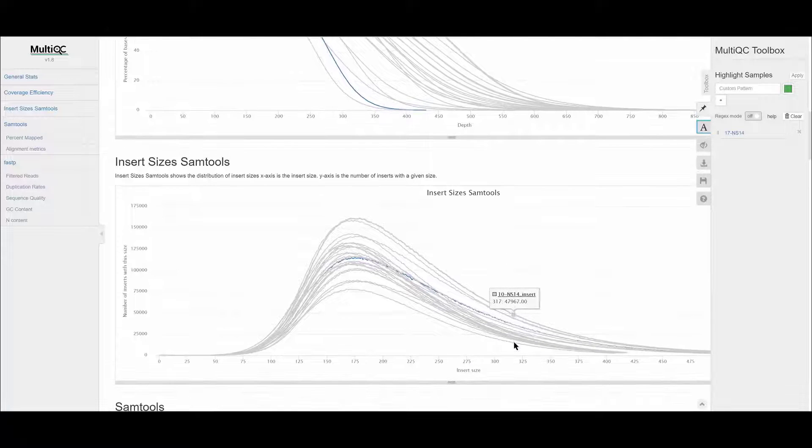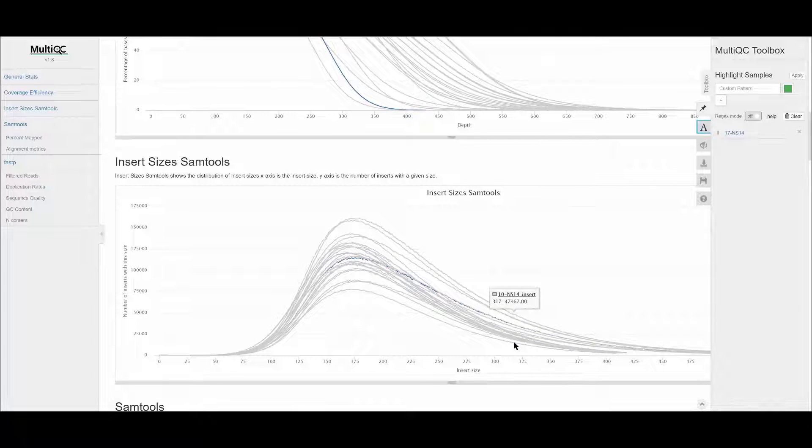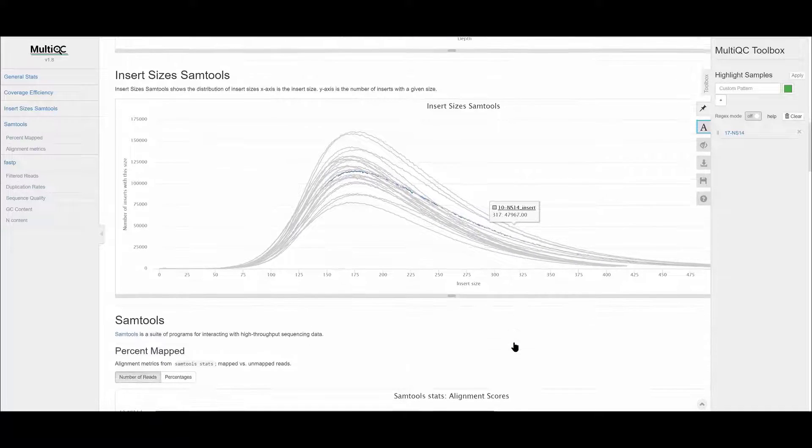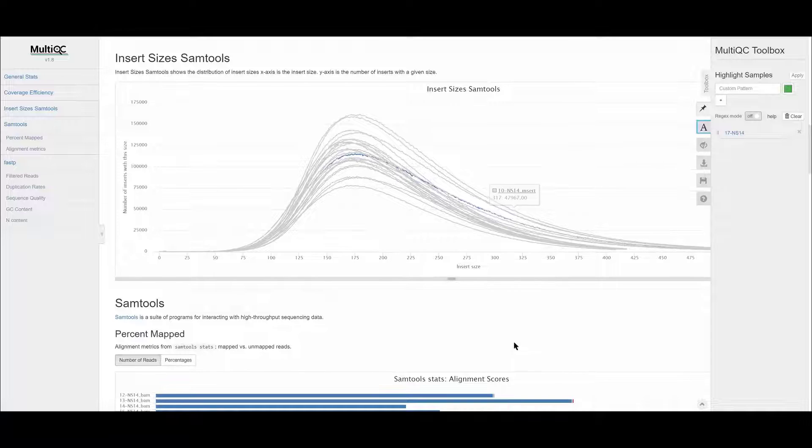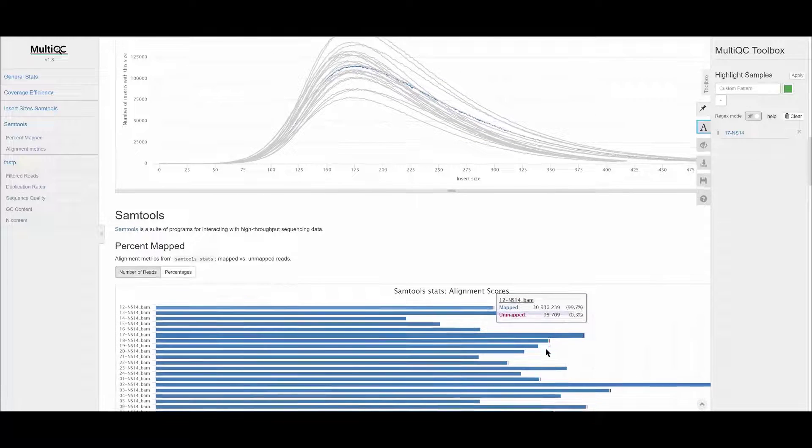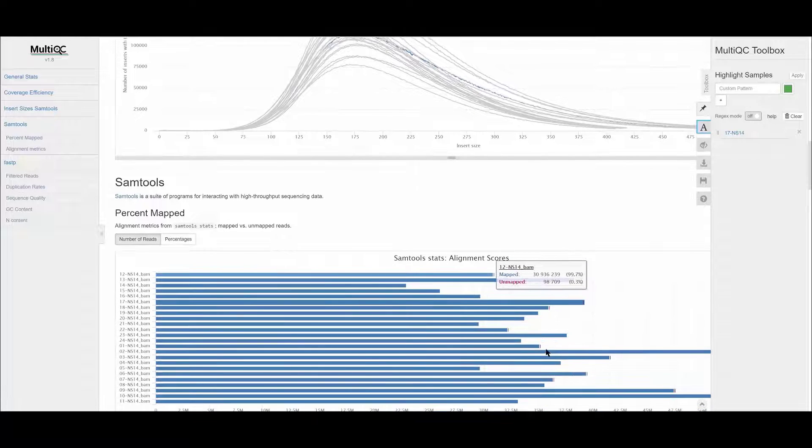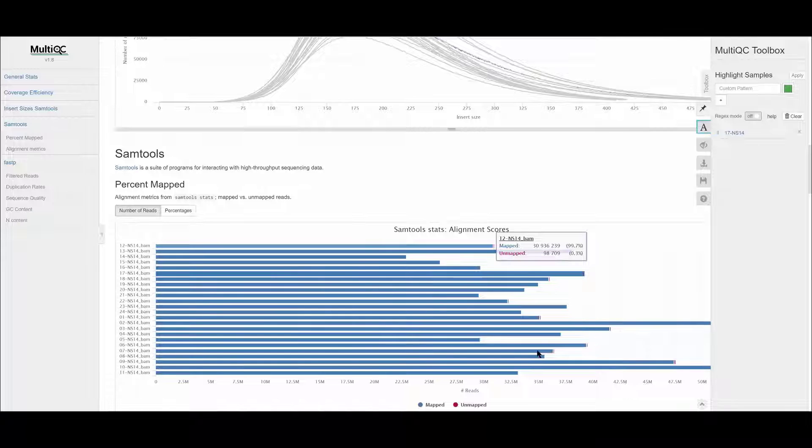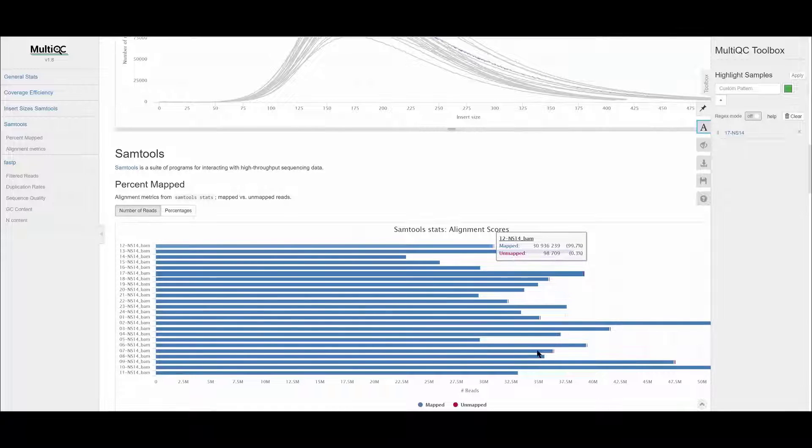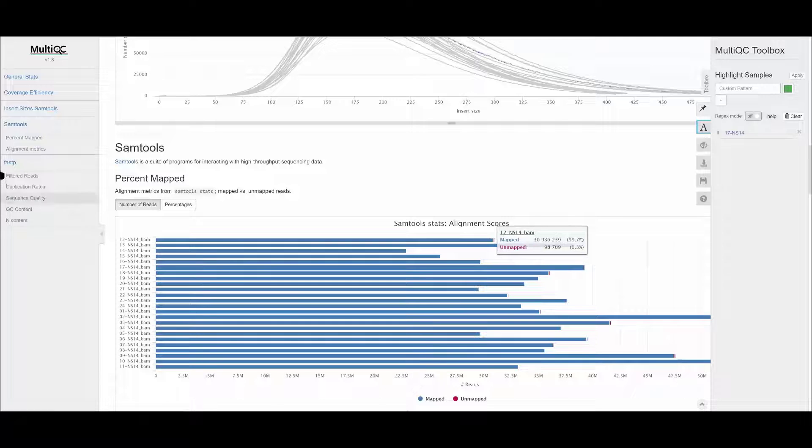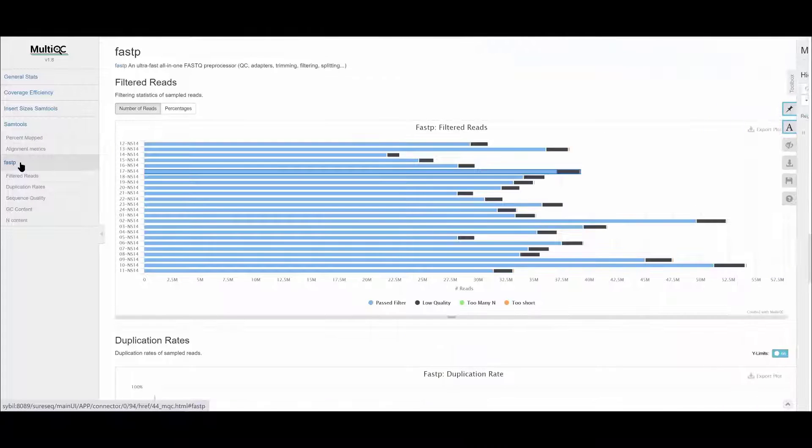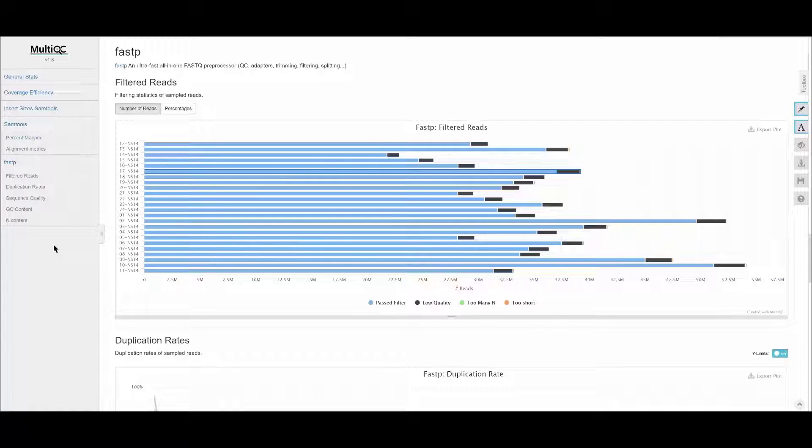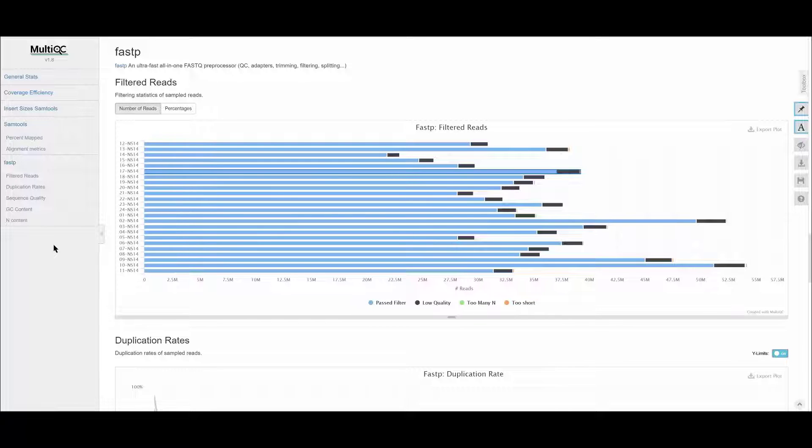As you scroll down further through the report, you can see the output from the other modules used in the analysis pipeline. SAM tools is a suite of programs for interacting with high-throughput sequencing data, and FastP is a tool designed to provide fast all-in-one processing for FastQ files.